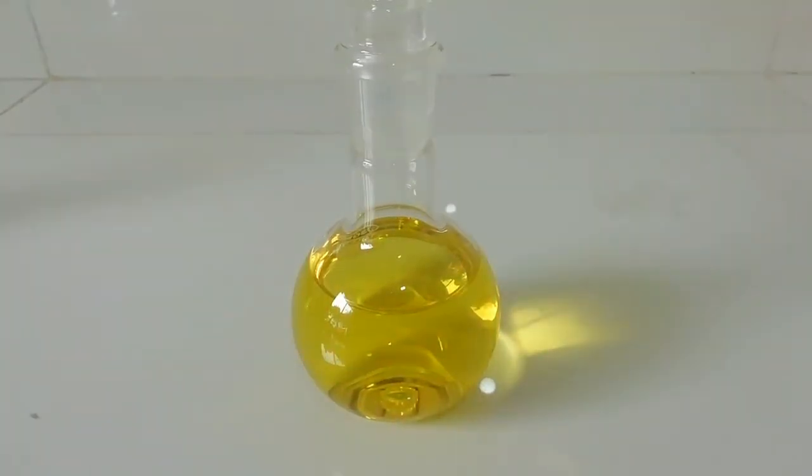We need to shake this flask. When I shake this flask, the oxygen in the flask reacts with the indigo carmine indicator and it varies the oxidation states. Therefore according to the oxidation state, the color will change.